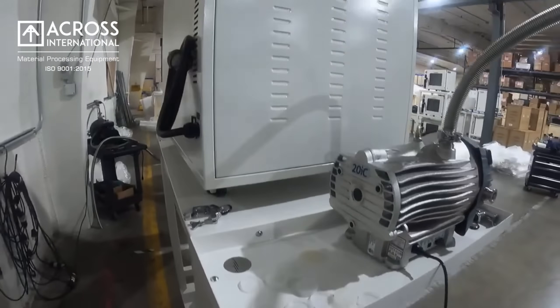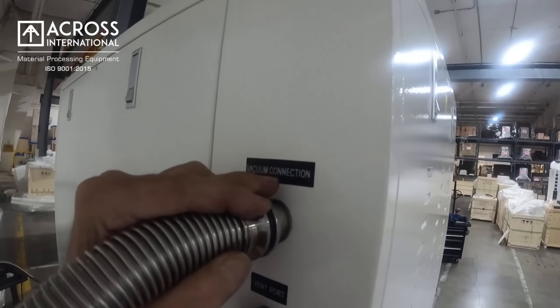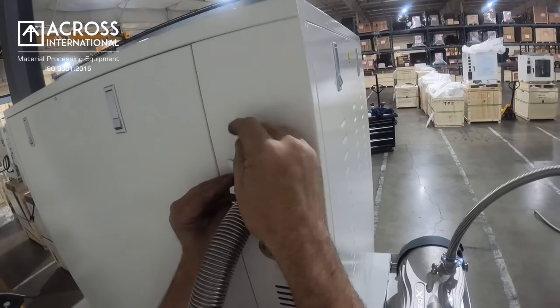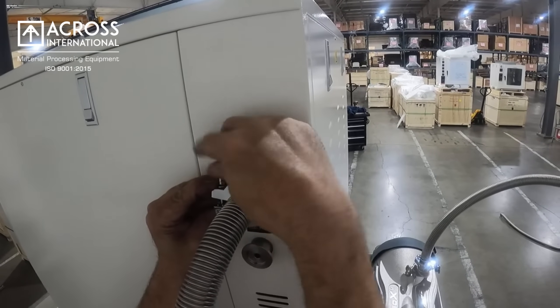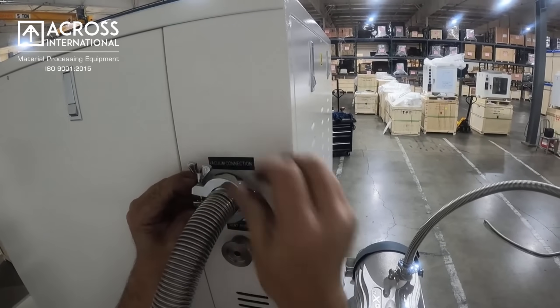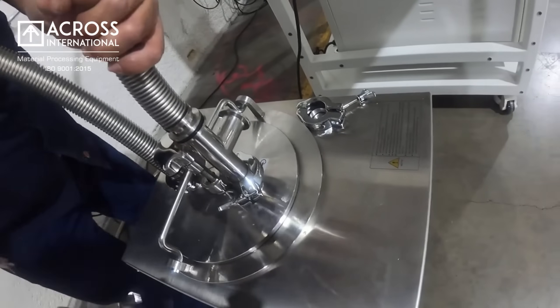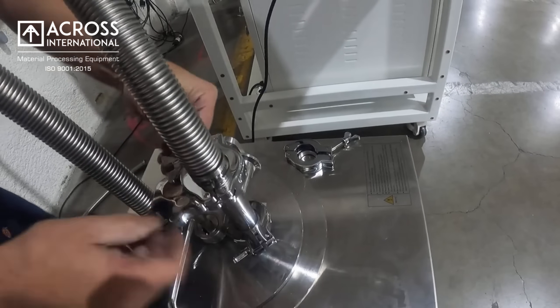We have another two meter bellow. Attach this with your seal and your KF 25 to your vacuum connection. Tighten your clamp. We'll take the other end of the bellow and secure it to your cold trap. Tighten your clamp using your seal and KF 25 connector.